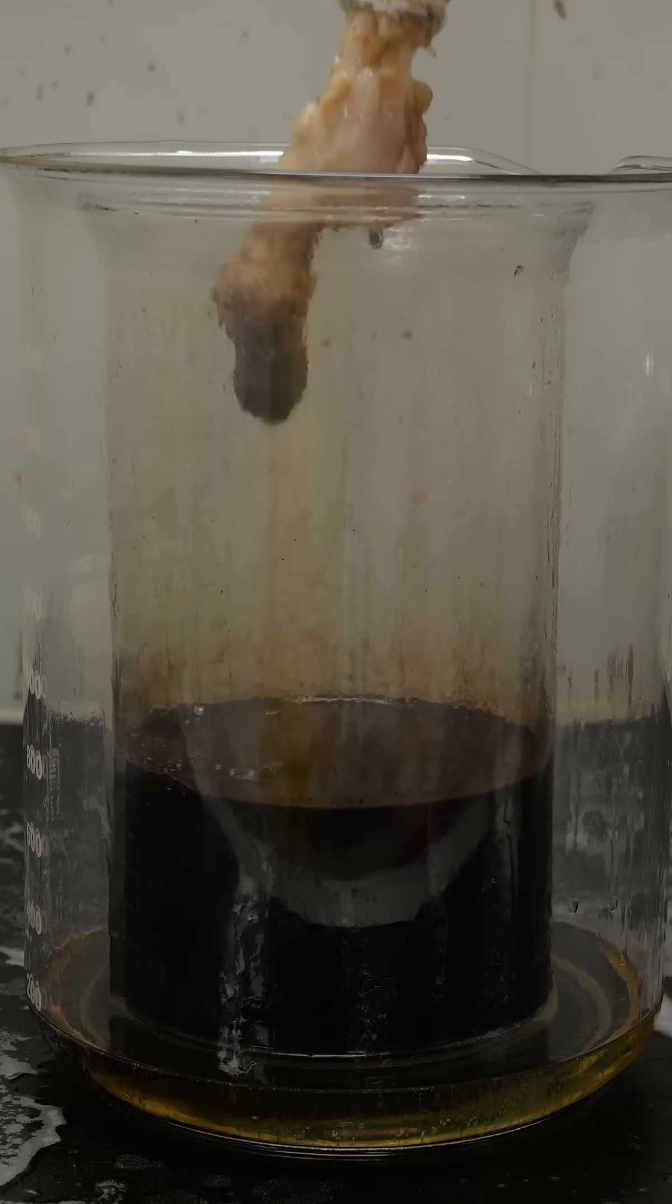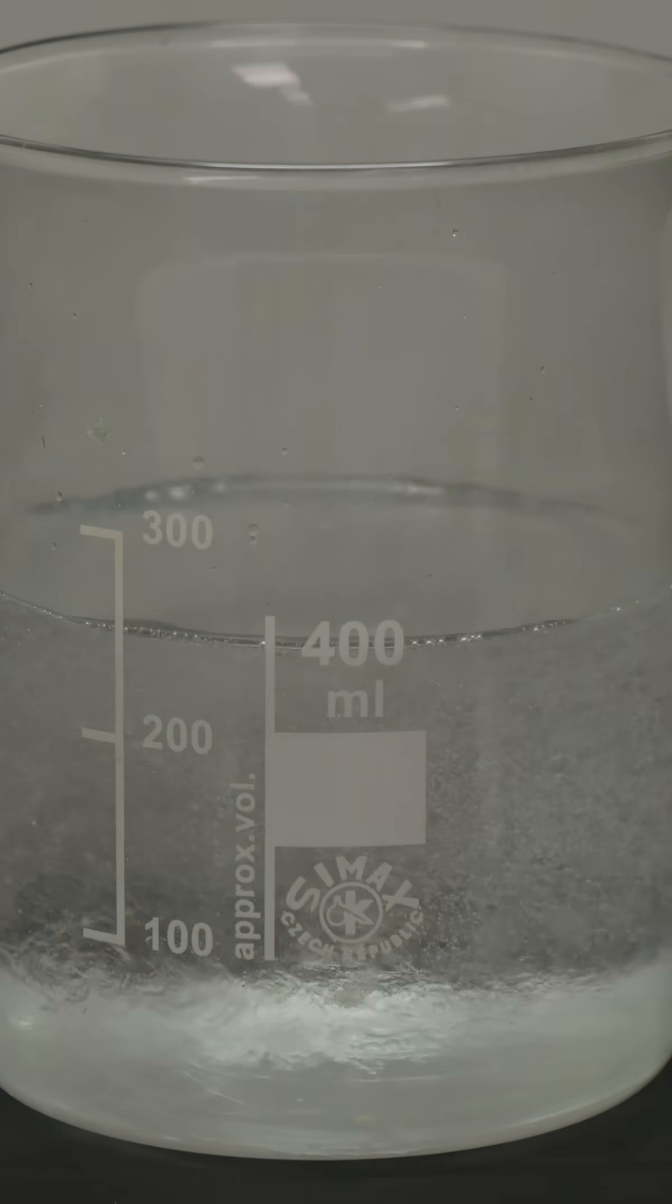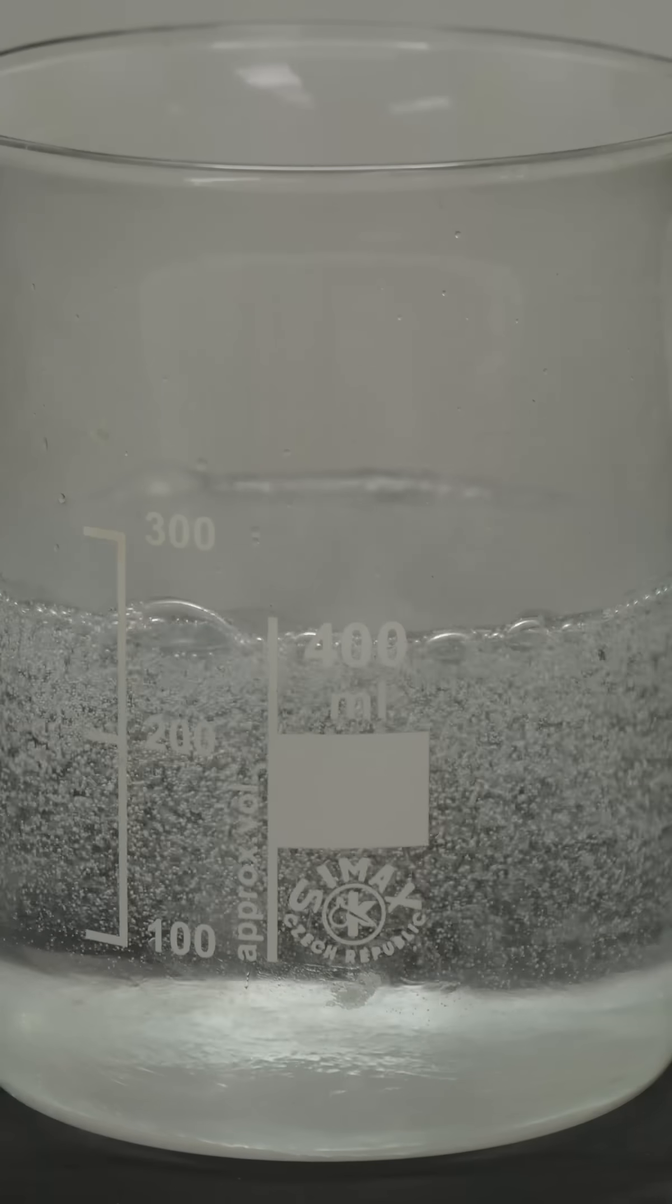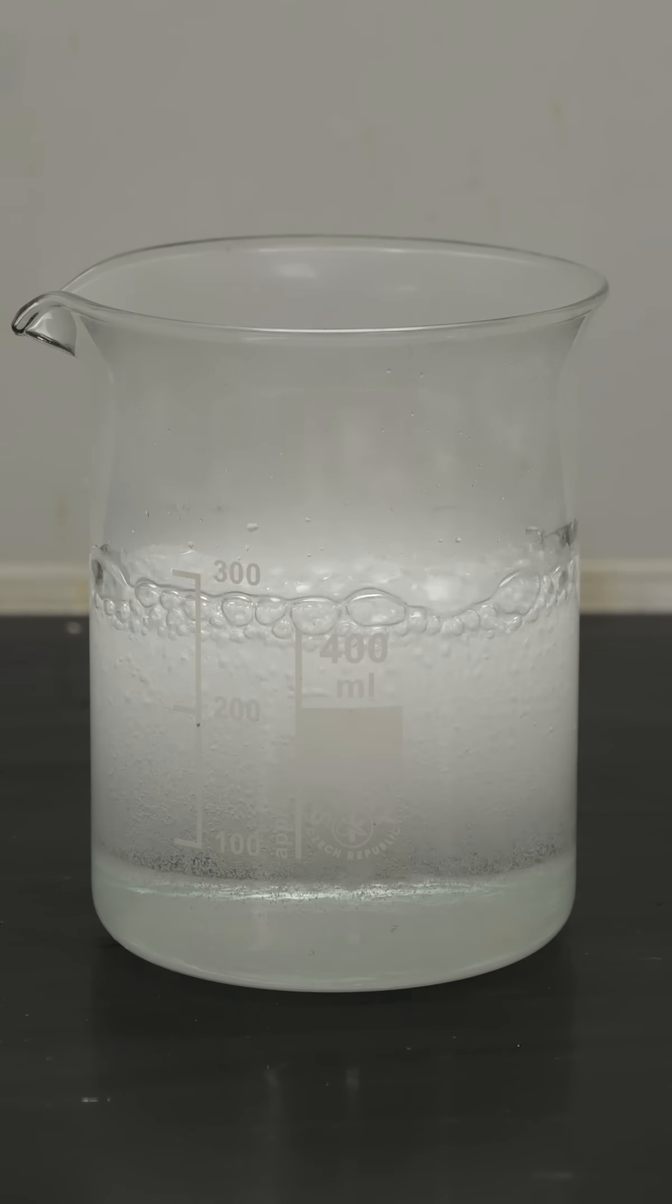Piranha acid is a mixture of concentrated sulfuric acid and hydrogen peroxide. Both are chemicals that are dangerous on their own. When mixed, they form peroxosulfuric acid, aka piranha acid, and the mixture spontaneously starts to boil.